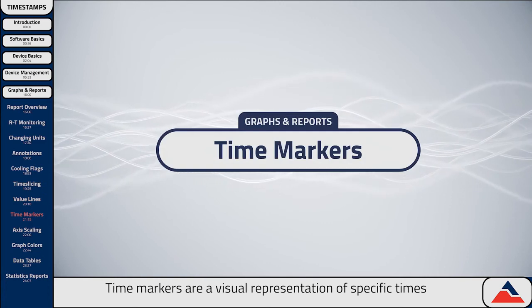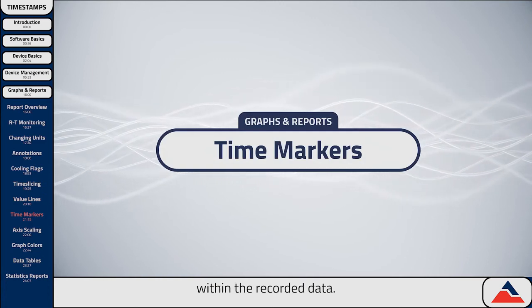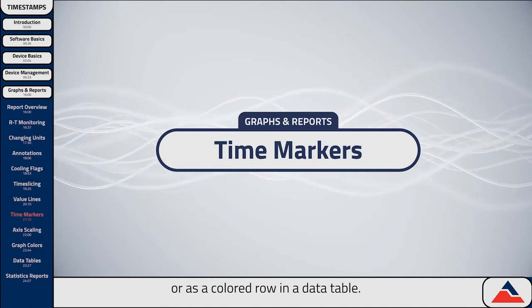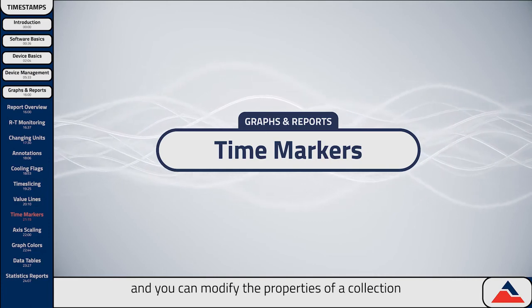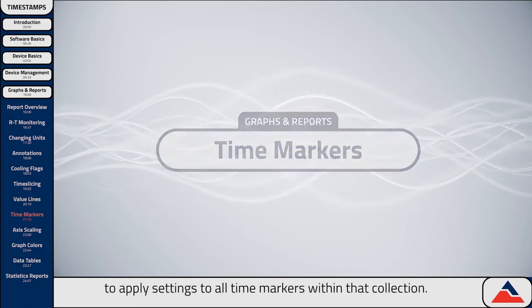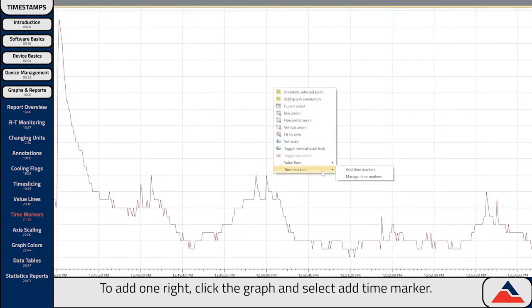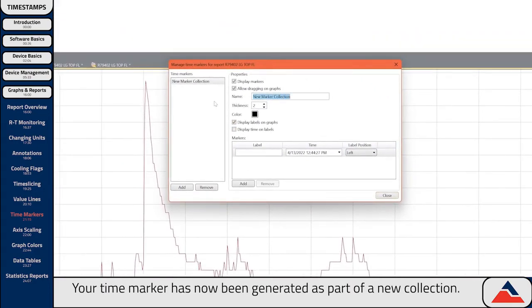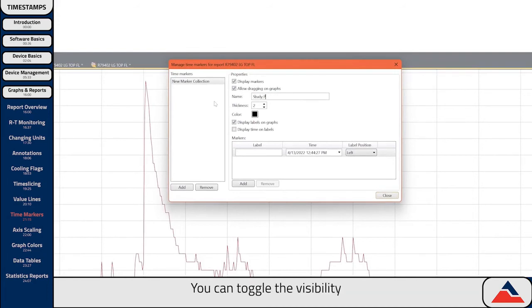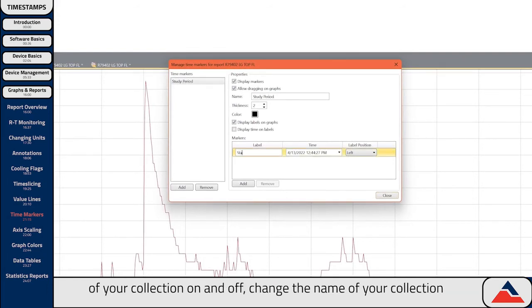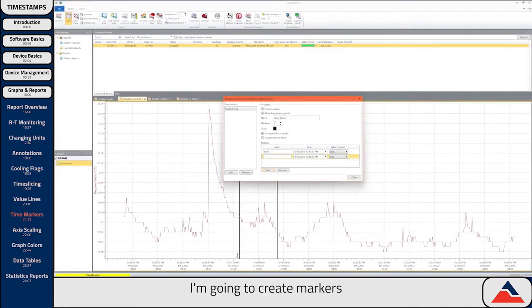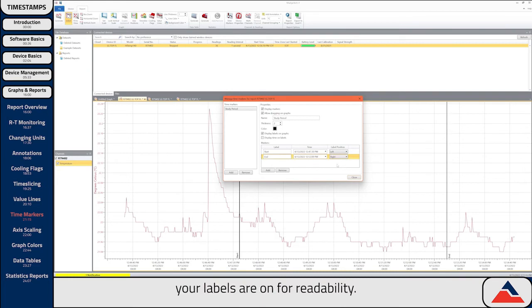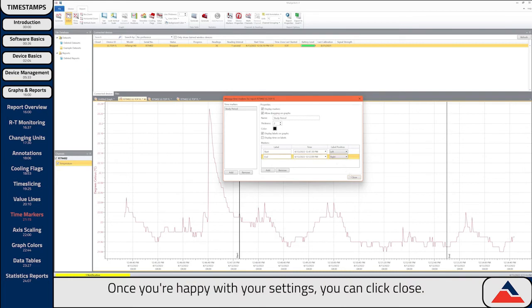Time markers are a visual representation of specific times within the recorded data. They appear as a vertical line in a graph report or as a colored row in a data table. Time markers are organized into collections, and you can modify the properties of a collection to apply settings to all time markers within that collection. To add one, right-click the graph and select Add Time Marker. You can toggle the visibility of your collection on and off, change the name of your collection, and edit and add new time markers as needed. You can also toggle which side of the line your labels are on for readability. Once you're happy with your settings, you can click Close.